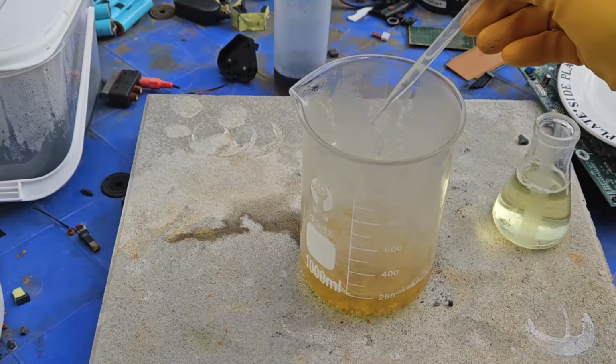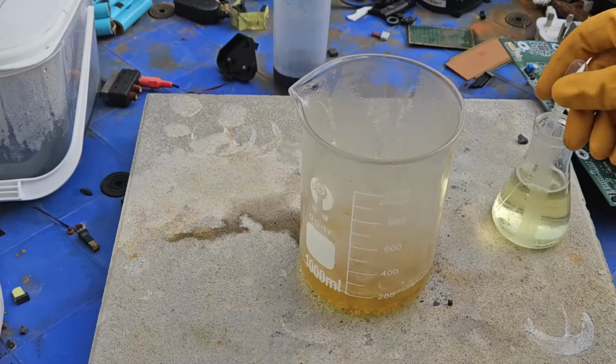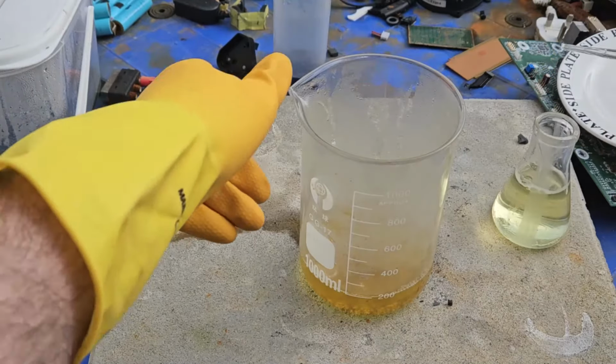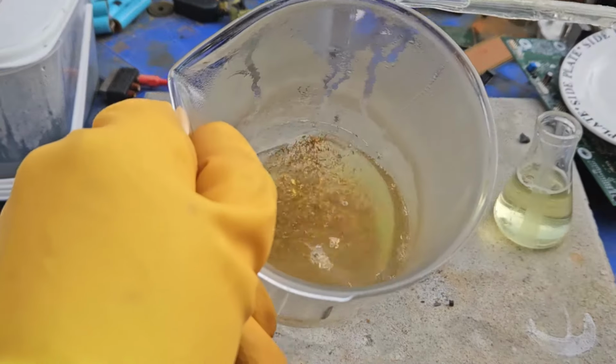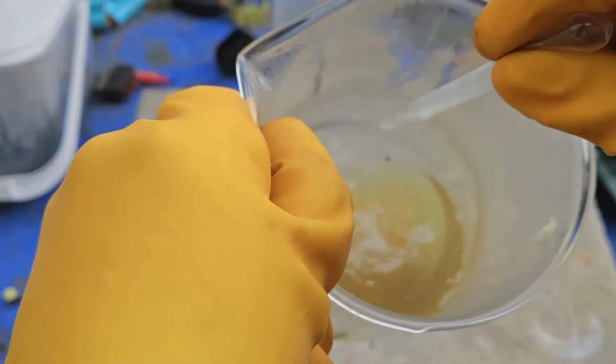Again, I'll just add some more bleach, and I'll let you see what I'm seeing. So when I add the bleach, you can see we get a reaction.